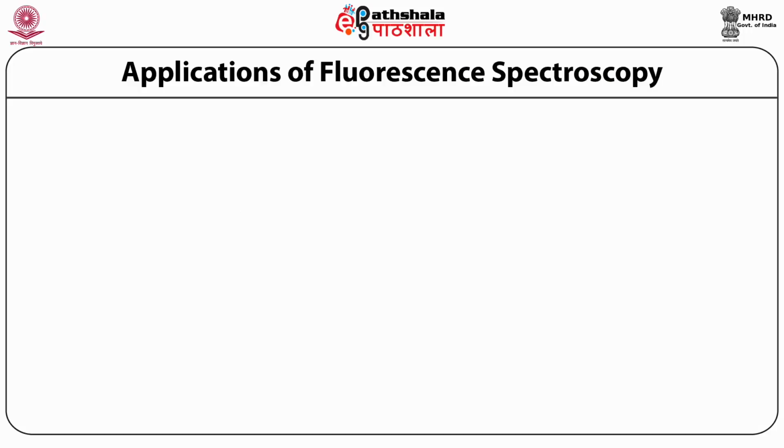Fluorescence spectroscopy is used for various applications. The first one is laser induced fluorescence spectroscopy for cancer diagnosis of human tissues. The laser spectroscopic techniques have the potential for in situ near real-time diagnosis, and the use of non-laser induced fluorescence has been used for diagnosing cancer.